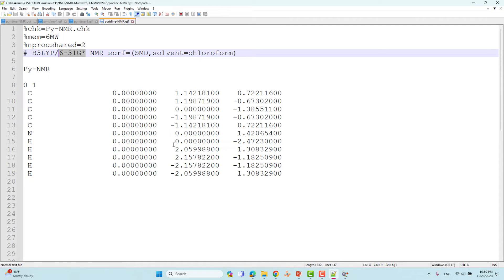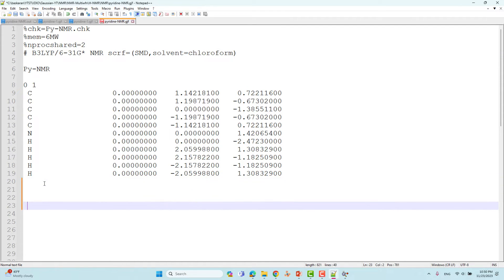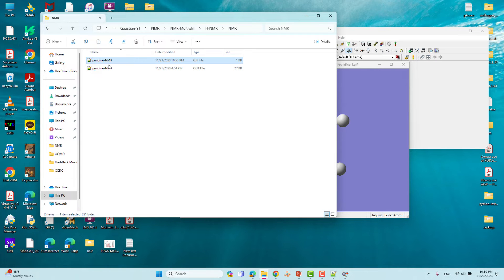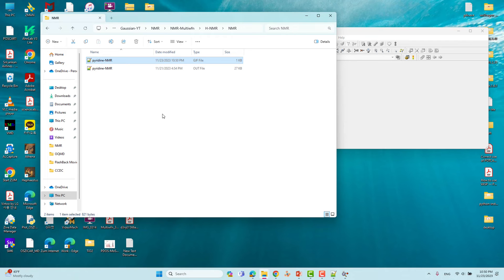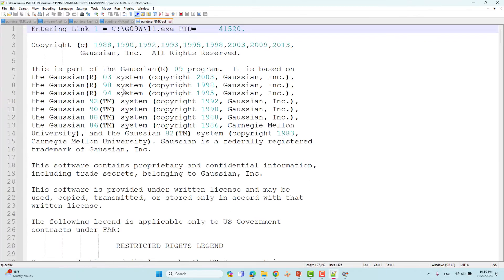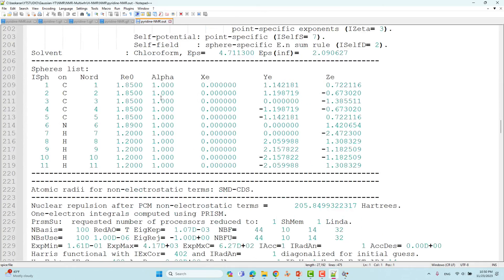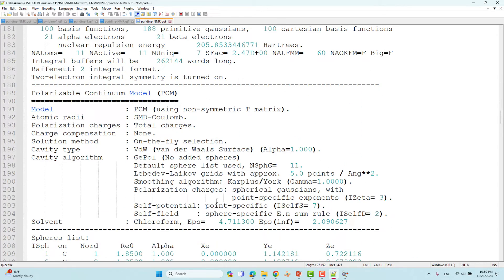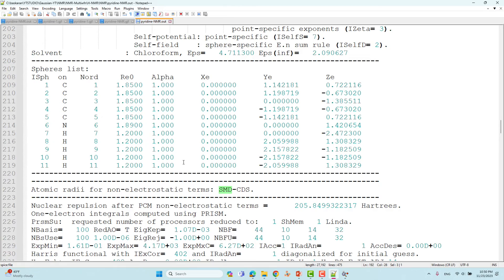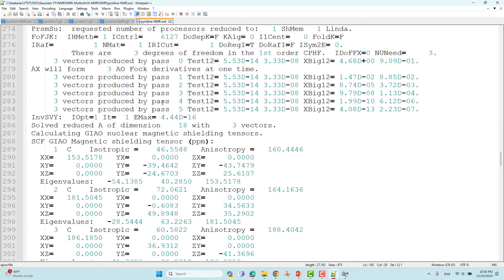Since only light atoms are present I used a single basis set. After the Cartesian coordinates give some space and then save and submit the input file. The calculation will complete within one or two minutes because this is a small system. Now looking at the NMR output file — we can see the solvent parameters and the SMD model details, and then the NMR results with the GIAO magnetic shielding tensors in ppm.